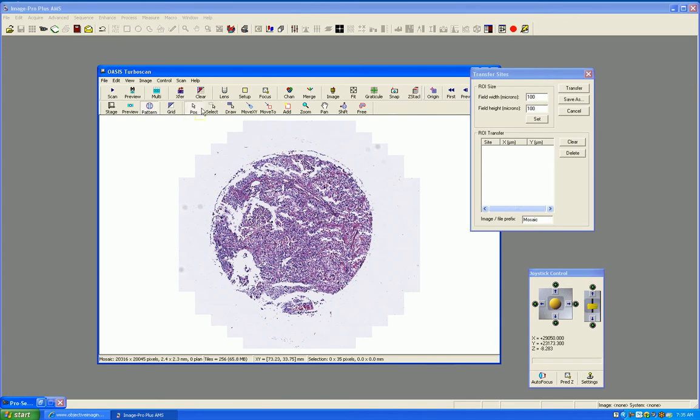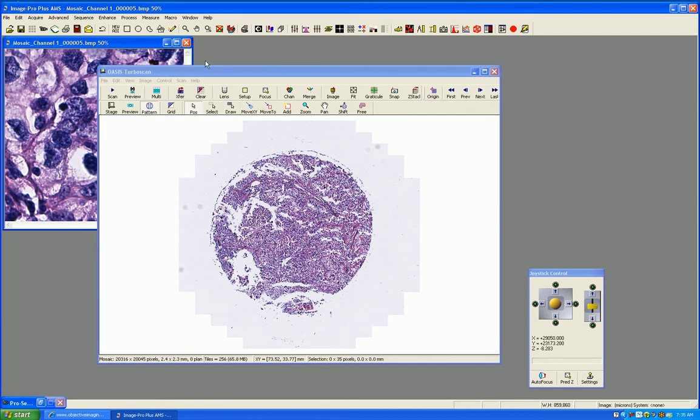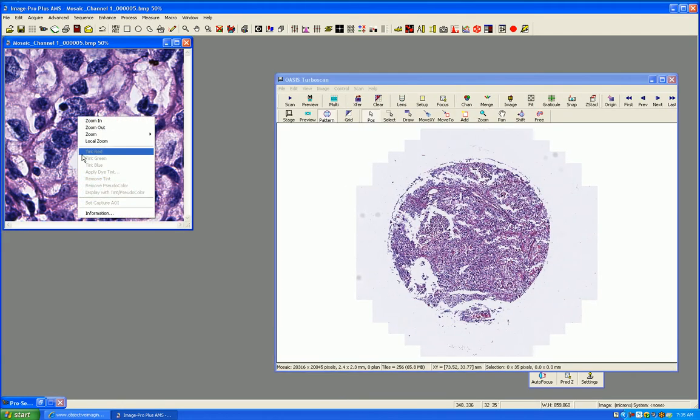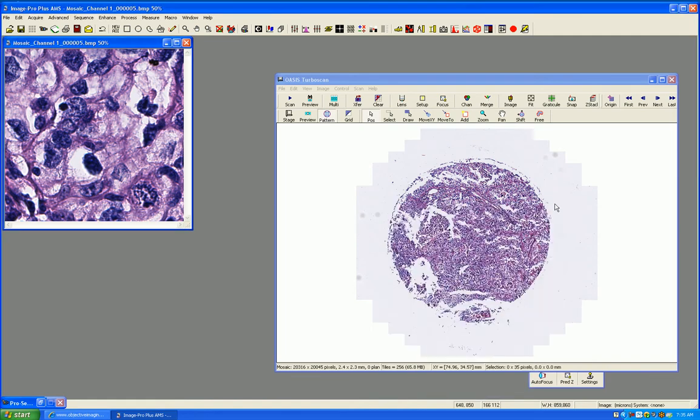Make sure this is indented. Now I'll go to Set. You see my box. This is the 2, this is 3, this is 4, this is 5. So we created 5 boxes. You have to make sure this positive is clicked. I had it on the ROI, which wouldn't let it work. Now when I go to transfer, it's going to transfer one at a time of these fields in there, and again the pixel calibrations are still there.